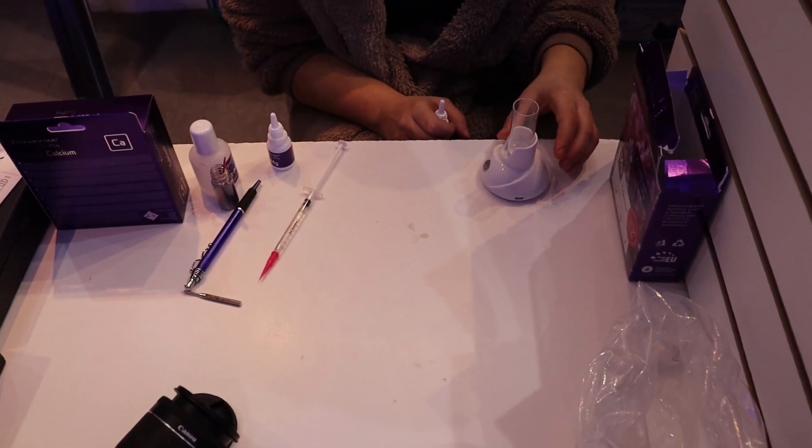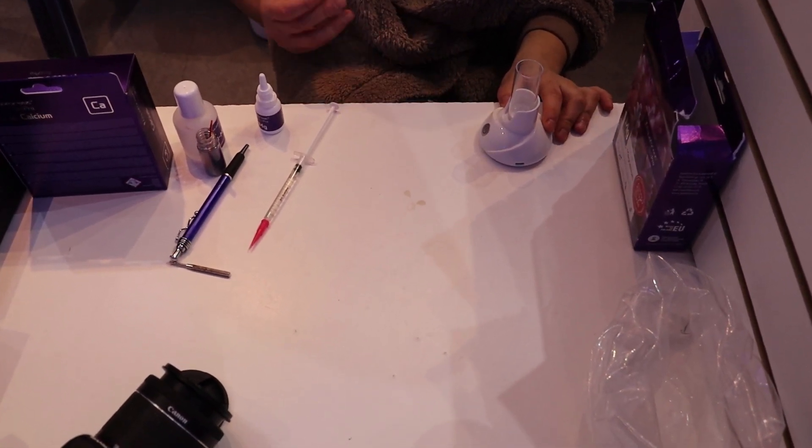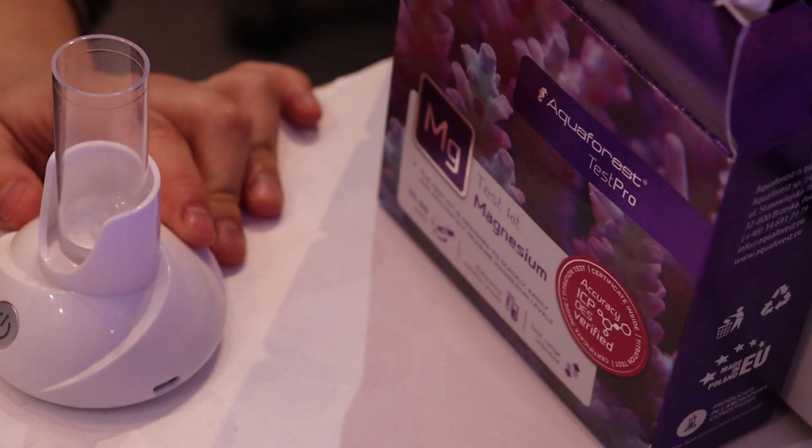Hey fellow reefers, Marchu again in the Frag Box, and today I'm going to show you how to properly do a test. We're going to do the Aquaforest Magnesium Test Pro.